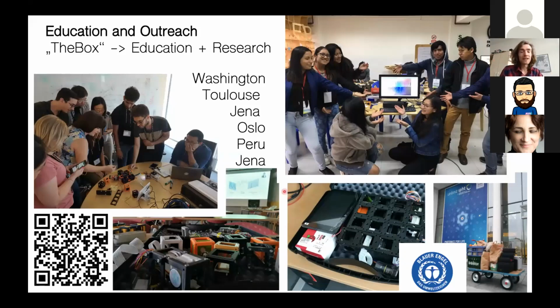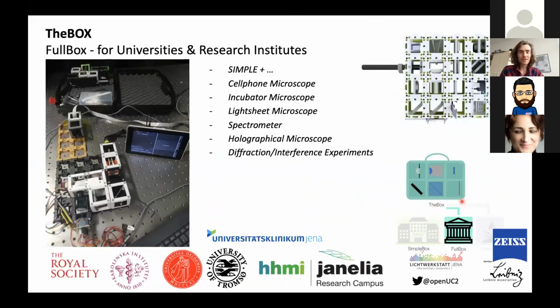And so we compiled everything here in a box. So it's really called the box, and we have plenty of boxes now with different titles meant to be used for different institutions, for example, for universities, for schools, and so on. And what we tried was always to maintain somehow a CO2 limited budget when we're traveling. Well, and now since there's Corona, we also had to make sure that this can happen over the air. So now we have compiled an online workshop, which we performed already a few times. And it can do basic experiments like a telescope or a simple microscope, but also a light sheet microscope or a spectrometer and all that stuff.